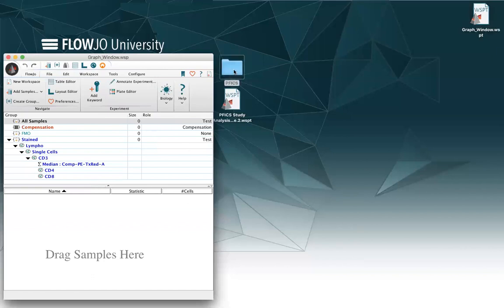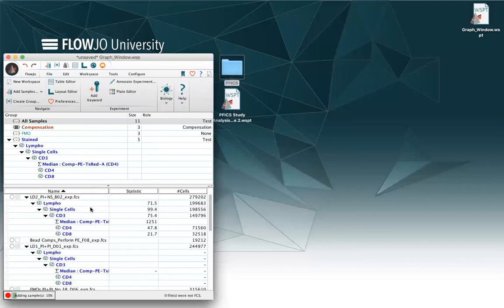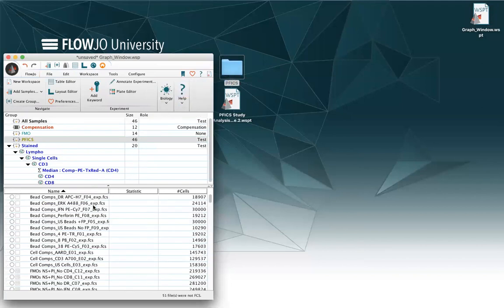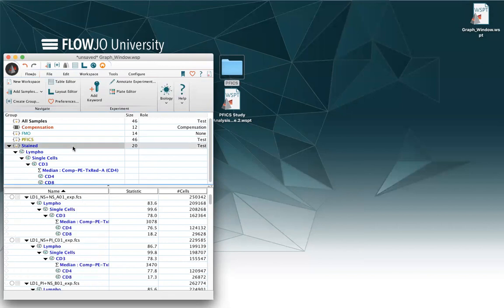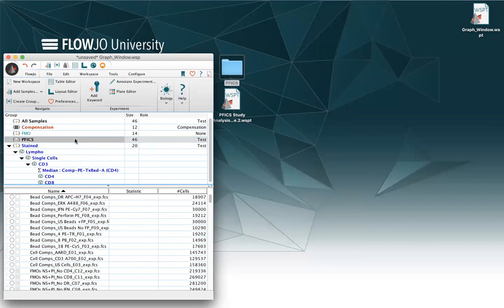So I can load a new set of data in it, and I will see that automatically I have my stained FMO compensation and all samples group populated, and I have a new group right here, which is the group automatically created when adding a folder.